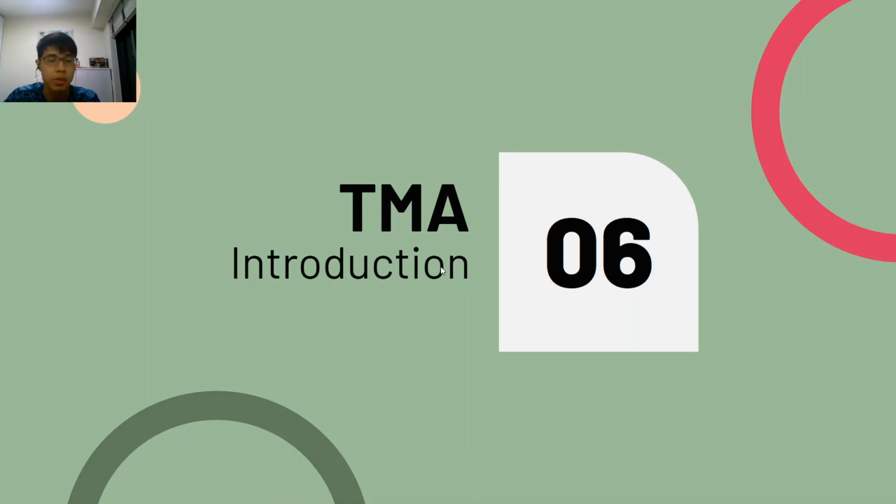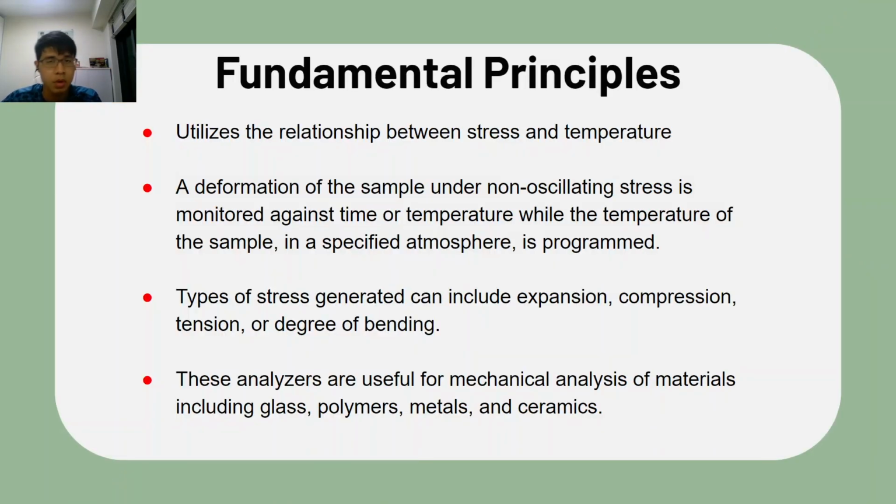Right, hello everybody. Today I'll be going through more on the TMA, which is the Thermomechanical Analyzer. Before we begin, I would just like to go through the fundamental principles of the analyzer, which basically just utilizes the relationship between stress and temperature.